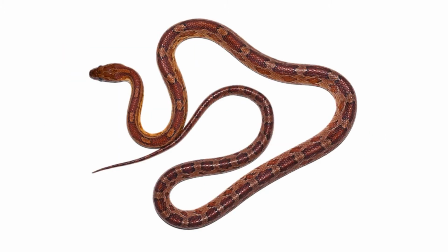Pantherophis guttatus is a colubrid snake native to southern North America. It is one of the most popular reptiles in captivity. It is non-venomous and lacks fangs, instead using constriction to subdue prey.